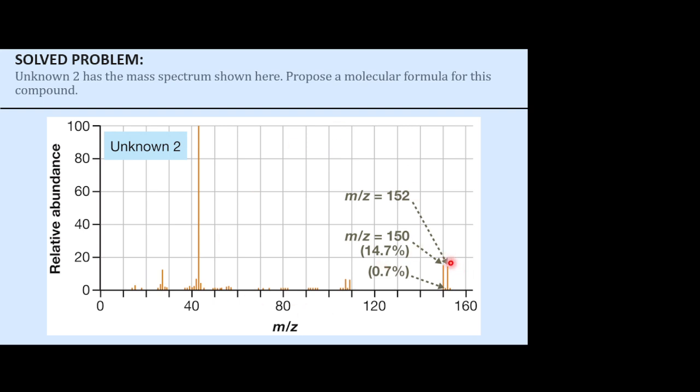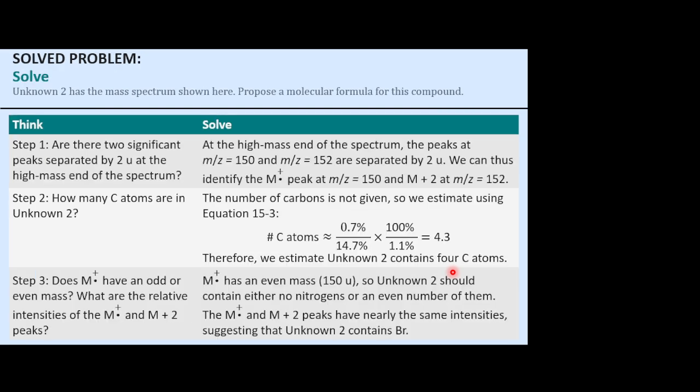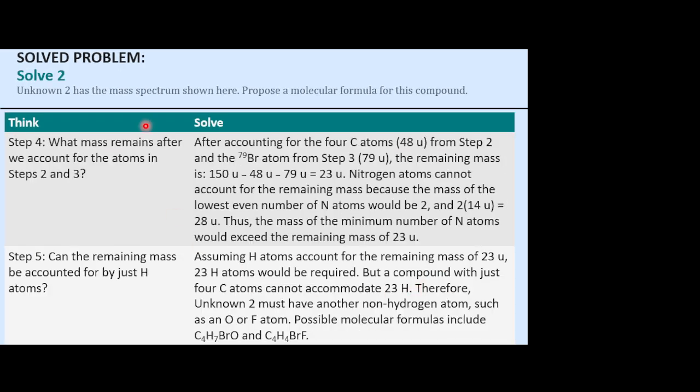The easier one is the isotopic ratio right here. The bromide is nearly an equal ratio, right? The chloride is only a 30% ratio. And so this one's very obviously bromide because they're almost equal, right? Really close. Okay, and so we go off onto the next part.